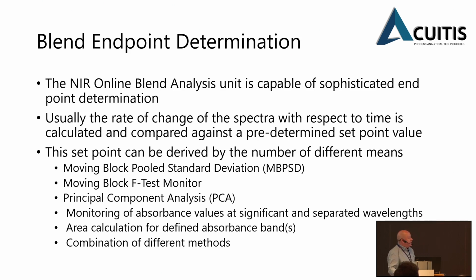And if anybody's worked in this area, it's no surprise to know that often the dispersion of the different ingredients within a blend actually happens at different dynamics and different rates as well. So you might have a very nice uniform content uniformity from the perspective of API concentration, but a functional excipient within the blend itself can also not be dispersed correctly, and you can track the dispersion of those sorts of things using PCA.